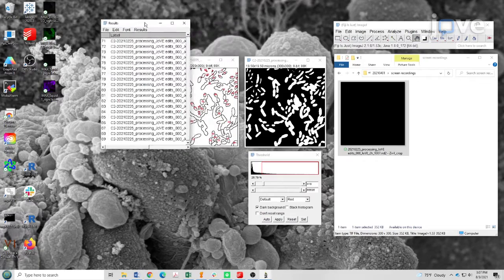This method can be easily modified to quantify competition between diverse, culturable microbes. Additionally, the experimental setup can be optimized for use on either upright or inverted microscopes.